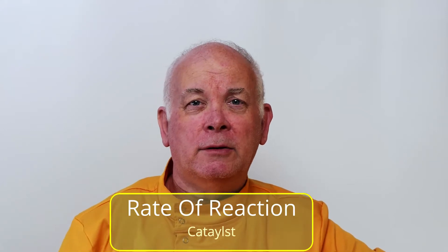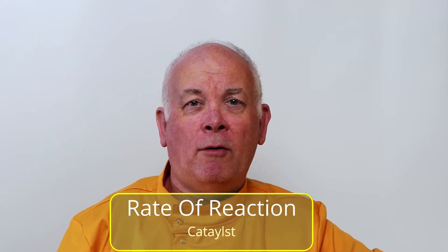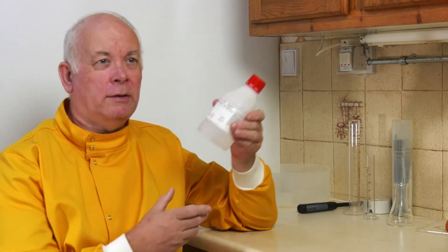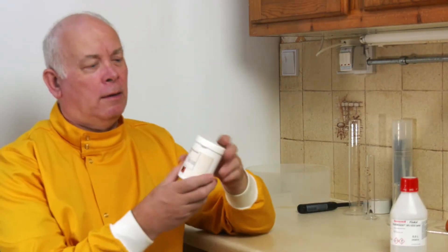Rates of reactions - one of the things we can look at is the effect of a catalyst. So in this experiment we are going to take some hydrogen peroxide and we're going to have a look at the effect of adding manganese dioxide as a catalyst and see how it affects the rate of the reaction.